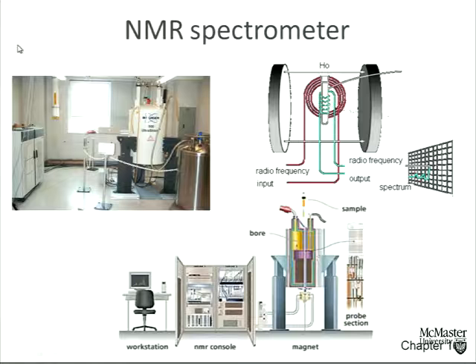We have a couple of coils. These are like radio coils. Radio frequency input excites the nuclei, and we measure the energy output with a second coil that is wrapped around the tube. The spectrum is simply a plot, so as we change either the magnetic field or change the radio frequency input, then at certain radio frequencies where the carbon nuclei resonate, we will get absorption. And so we're plotting the signal coming out as a function of the radio frequency input, in other words, as a function of the energy at which we excite it.